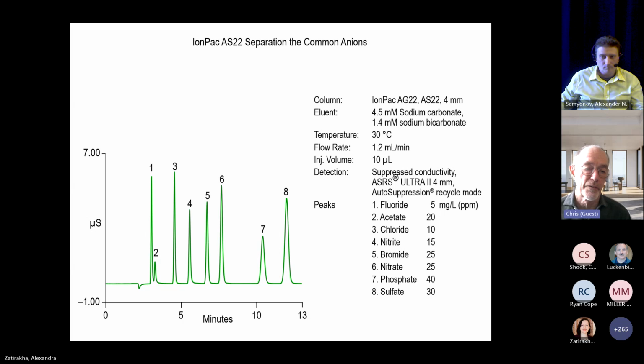This is all ether or carbon bonds in the network or ion exchange sites at the branch points.